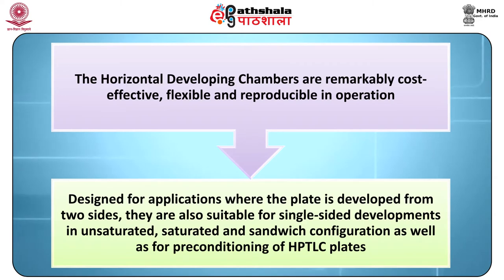However, a focus is required on the economic aspects, such as time requirement and solvent consumption. The horizontal developing chambers are remarkably cost effective, flexible and reproducible in operation. These chambers are made for applications wherein the plate is developed from two sides, and they are also appropriate for single-sided development in the unsaturated, saturated and sandwich configuration, as well as for preconditioning of the HPTLC plates.